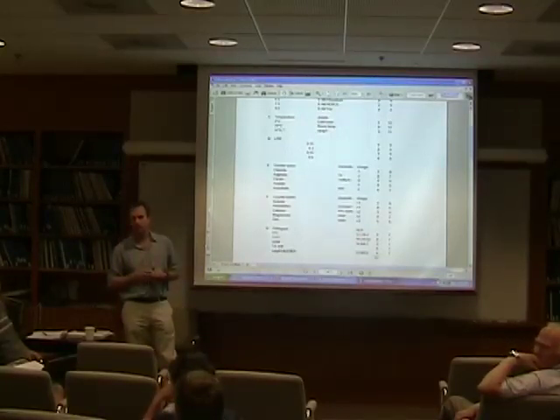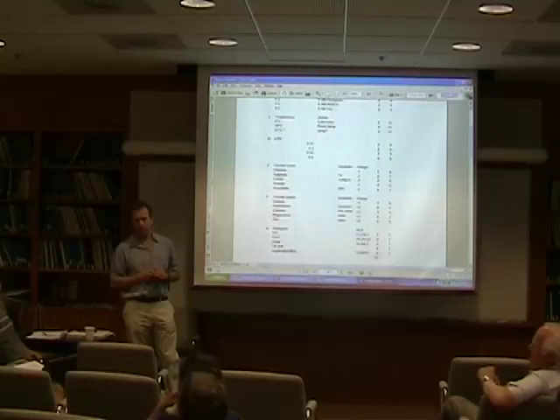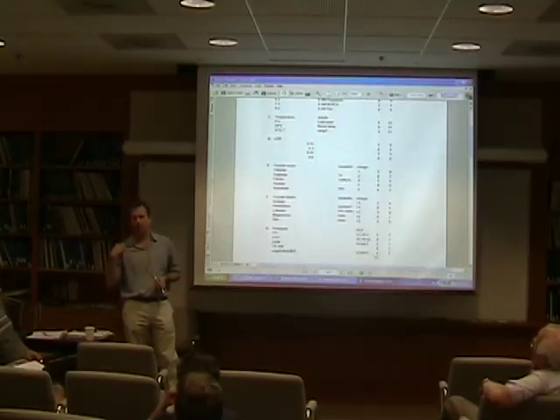Just making an observation, I'm coming from more of a 3D background. Obviously the comparisons you're trying to draw to the factorial screens are there, but you only screen 3 parameters really in any of the screens in 3D crystallization. And you have very, I won't say strict outcomes, but you have precipitate, a couple of different kinds, some sort of phase, and then crystalline, whether it's microcrystals or real crystals. So if you define more clearly what you should be getting as an outcome, and maybe minimize the number of different things as an initial trial, that might be easier, because there are many more parameters that you're trying to screen. Actually, in Carter's screens, they had about 7 or so different parameters that they were screening as well. So it's not all that different. It depends what you consider a parameter.